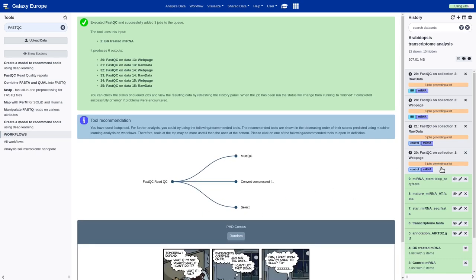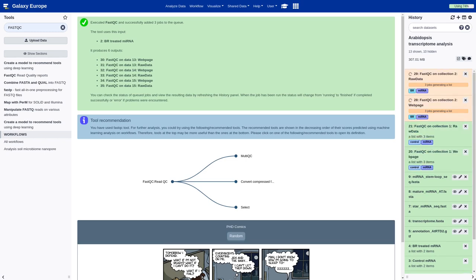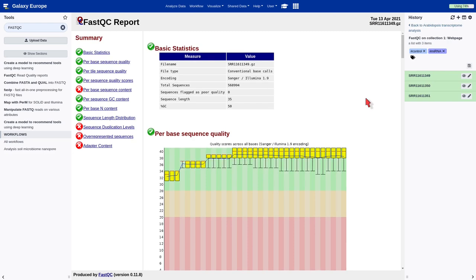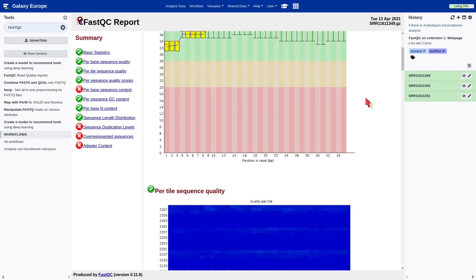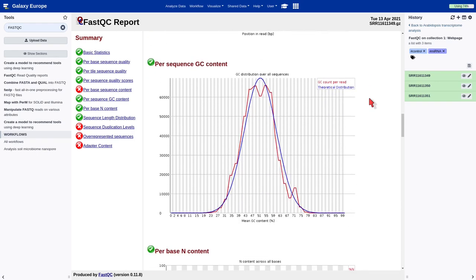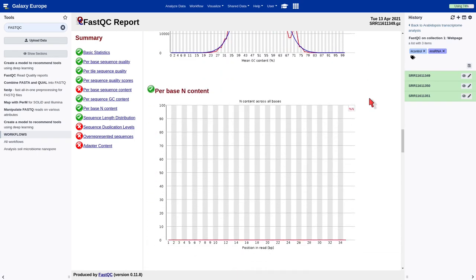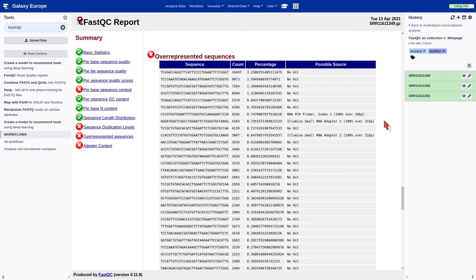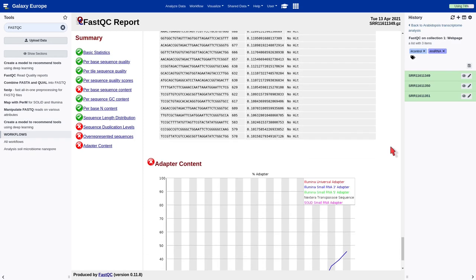FASTQC provides a simple way to do some quality control on our reads. Now, we can check the results of this tool. It generates two different outputs. Here, we can see the different information which it provides, like the per base sequence quality, per sequence quality scores, per base sequence content, per sequence GC content, per base unknown base content, sequence length, sequence duplication, and over-representing sequences. Here, we can see some of the adapters which are present in our reads.